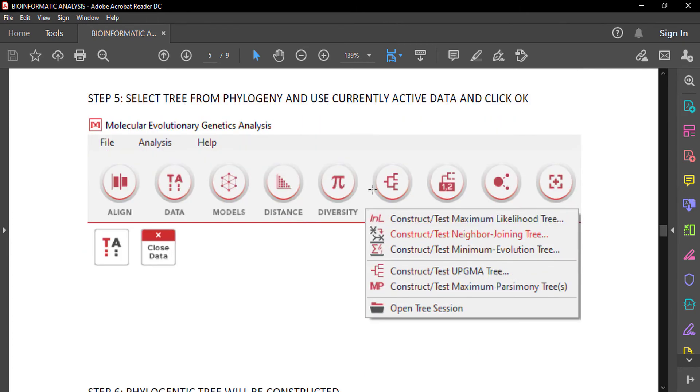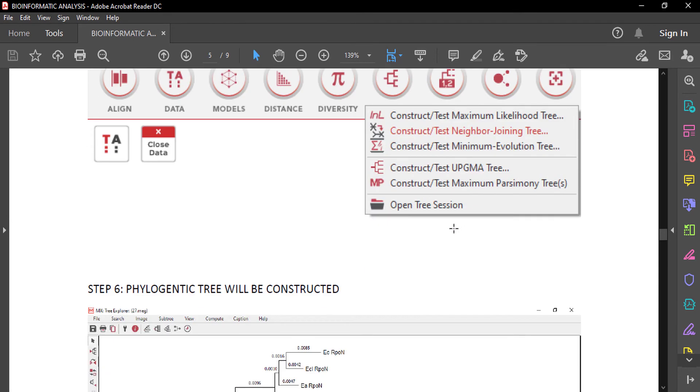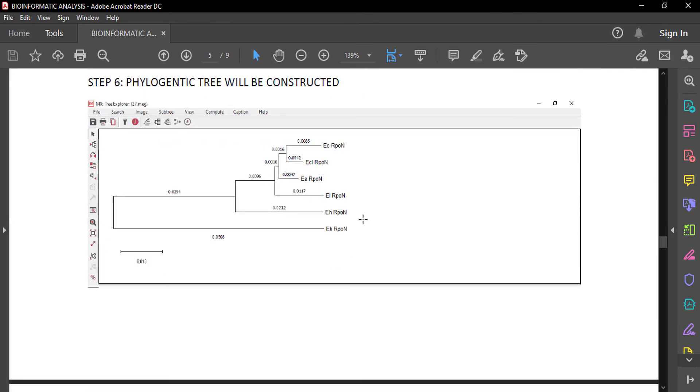We can construct the phylogenetic tree. Here we select the neighbor joining tree for currently active data and click yes. The phylogenetic tree will be constructed.